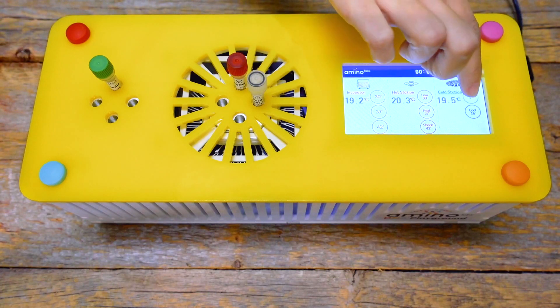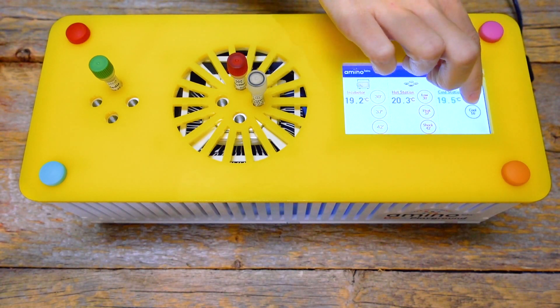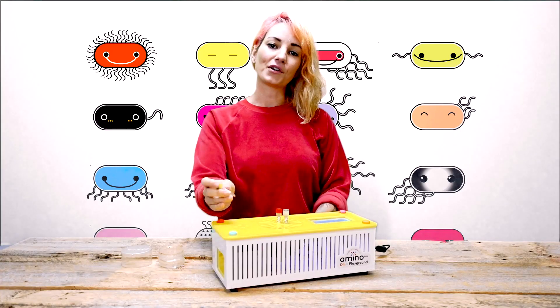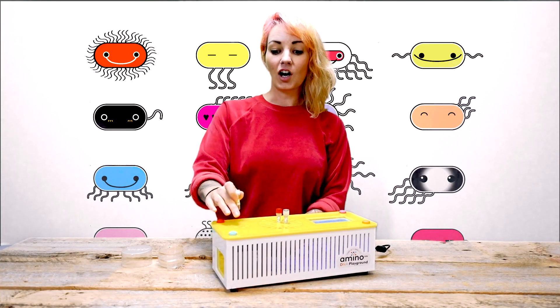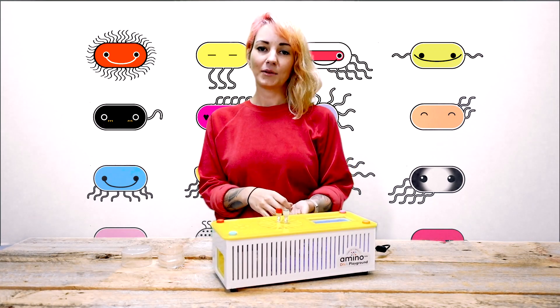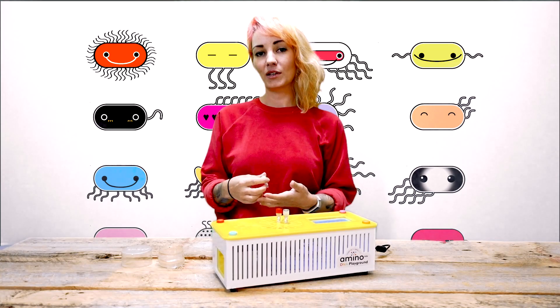This is the touchscreen — it's your control panel to control the different stations on the machine, but also your timer. As you'll see when doing your first genetic engineering or bio art experiment, the hot station is important because it lets you incubate cells and liquid at 37 degrees, but also heat shock your DNA.